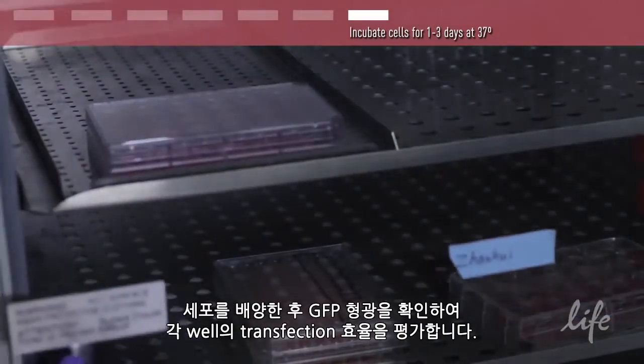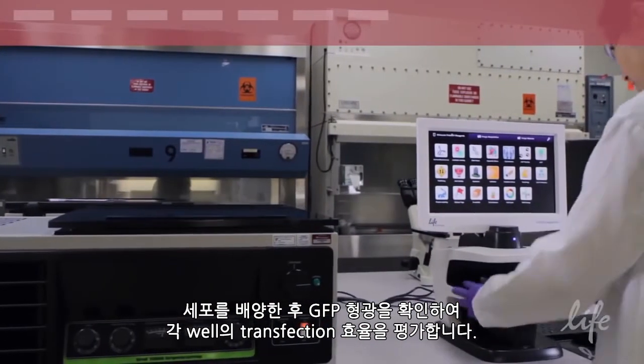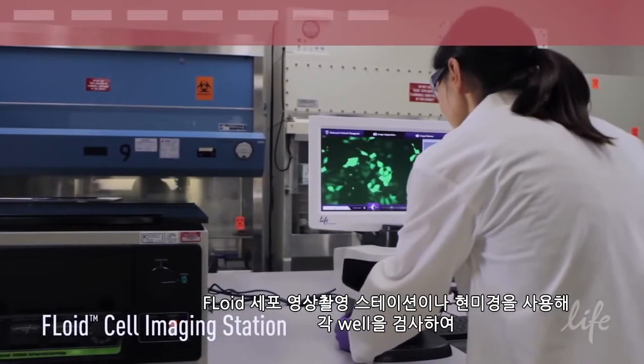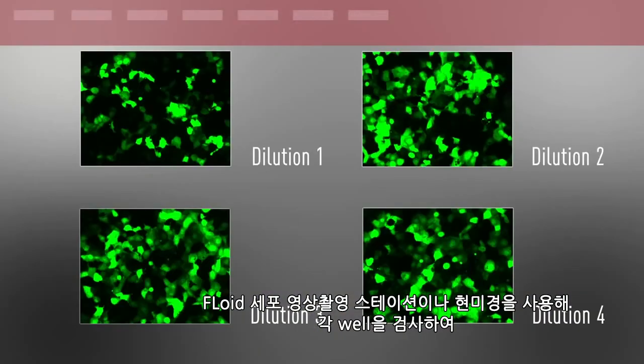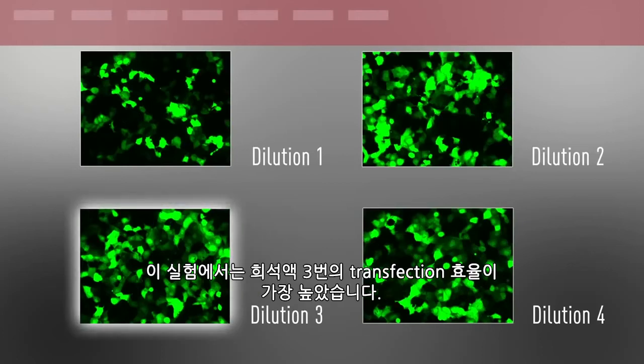After incubating your cells, assess the transfection efficiency in each well by viewing GFP fluorescence. Examine each well using a fluorescent cell imaging station or microscope to determine which concentration of reagent provided the highest transfection efficiency. In this experiment, dilution 3 provided the highest transfection efficiency.